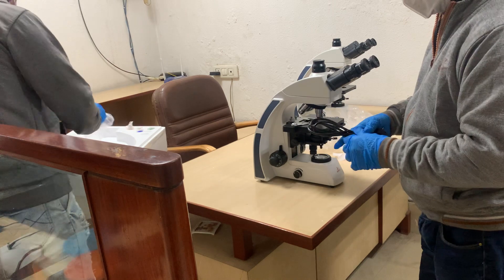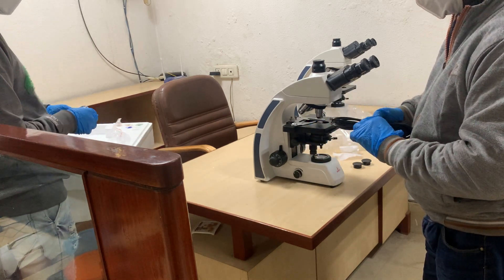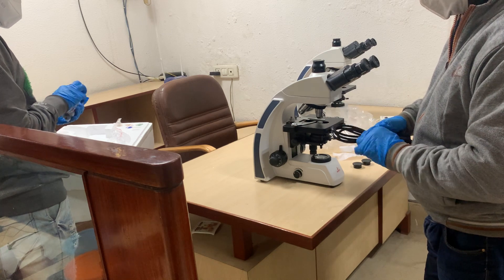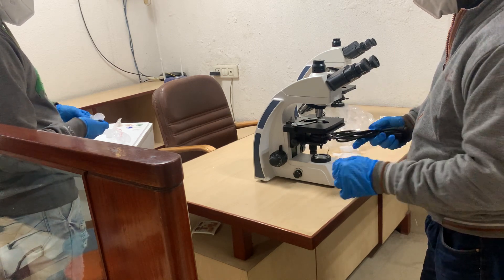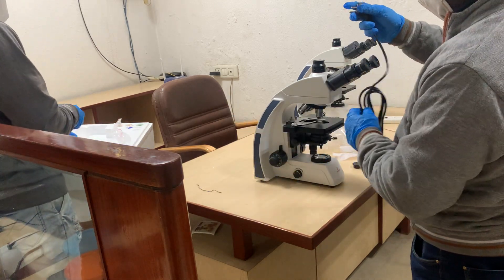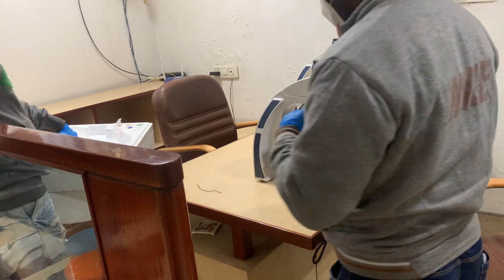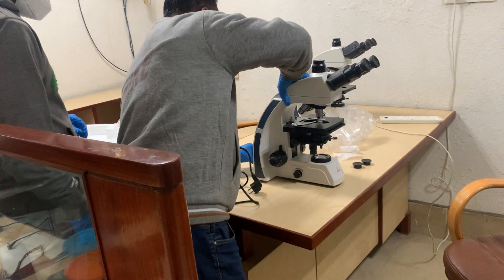The next step is to plug in the electrical cord. We recommend using a UPS or voltage stabilizer for a stable power supply, which will definitely help in increasing the shelf life of the microscope and the LED bulb used in the microscope.